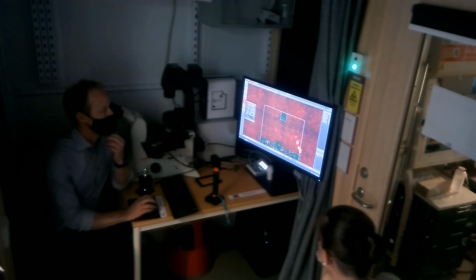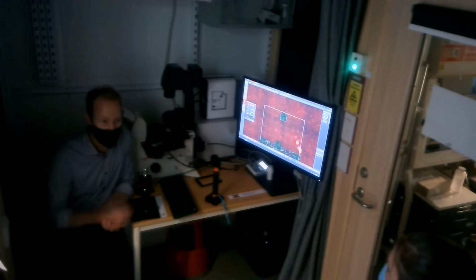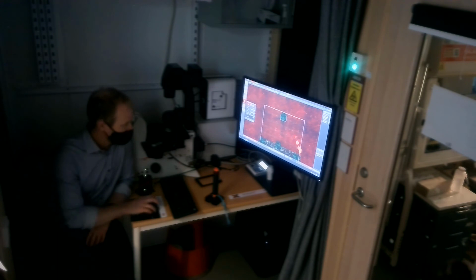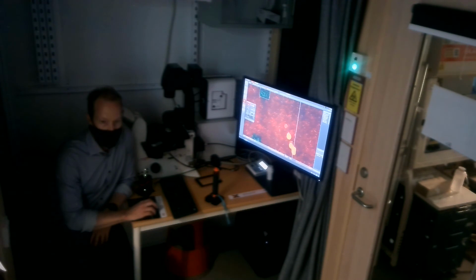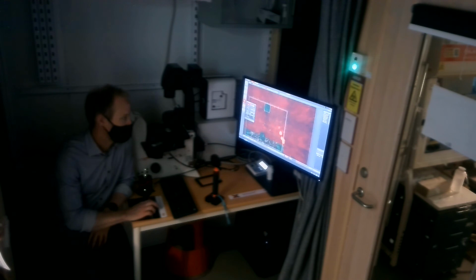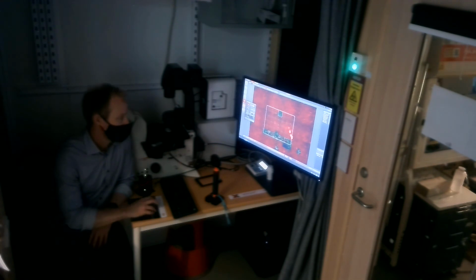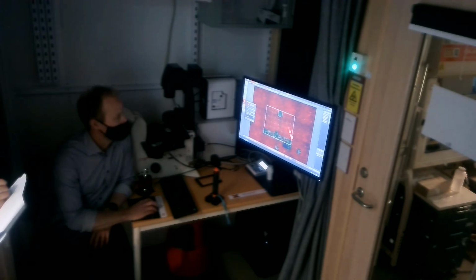When you do that, there are a few things you need to consider when you use autofocus. This autofocus is contrast based, or image based. It looks in the image for contrast. So running this every third one might completely throw it off. If it's doing an autofocus job here, this runs the risk of putting the focus completely wrong. This is why I'm saying that with software autofocus you always have to give a little more consideration to where you do it. So this automatic setting might not always be best.